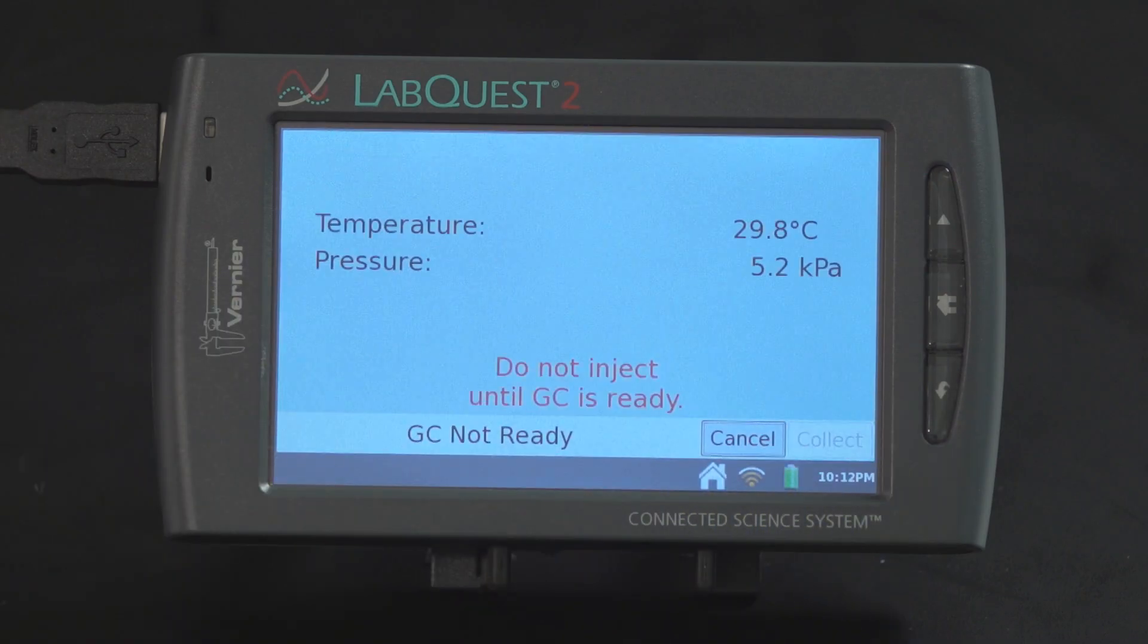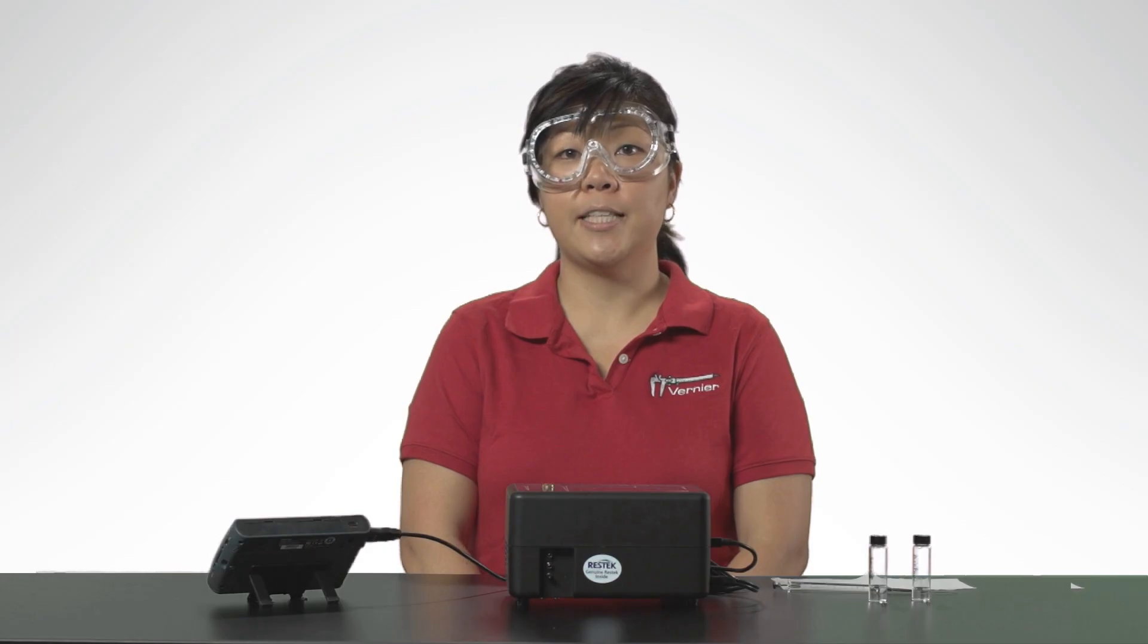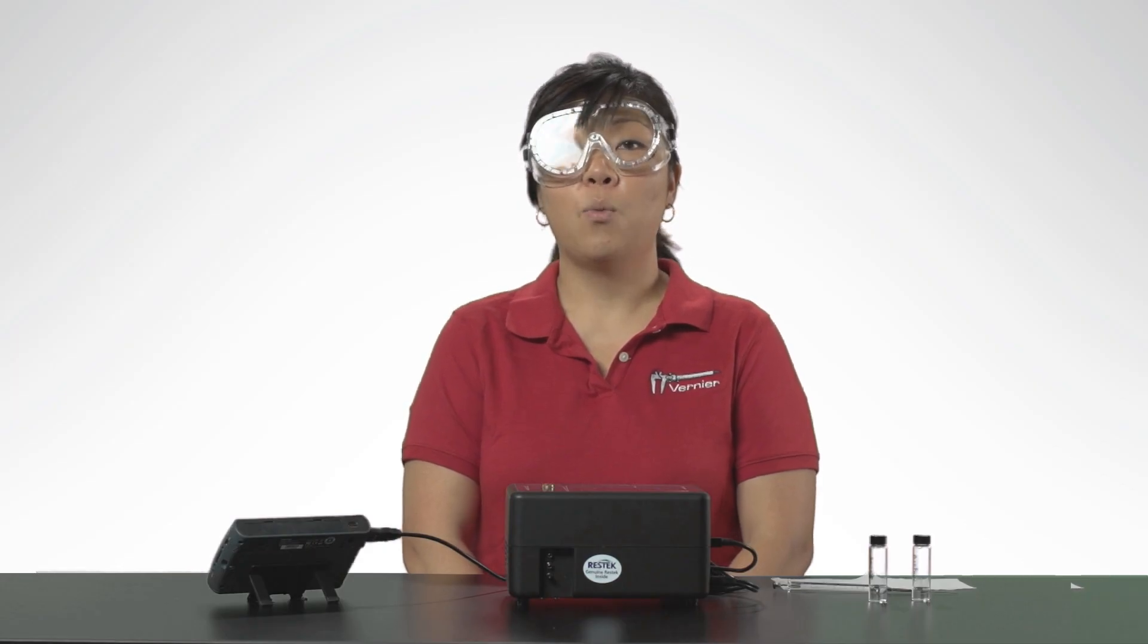A new message will appear. Do not inject until GC is ready and the LED on the Mini-GC Plus will be red. The Mini-GC will take a few minutes to warm up and stabilize.